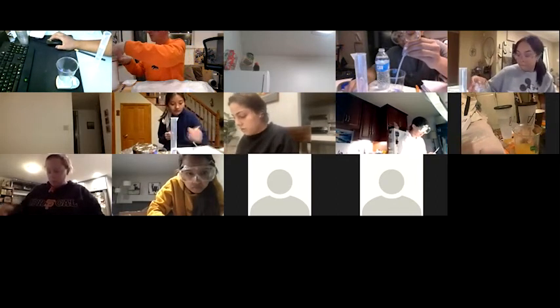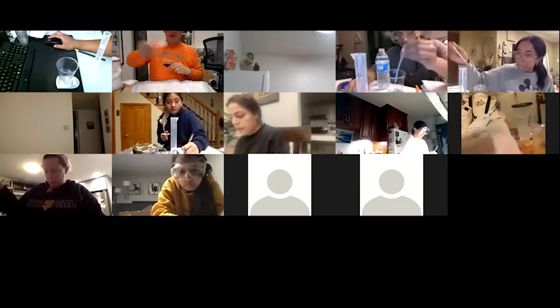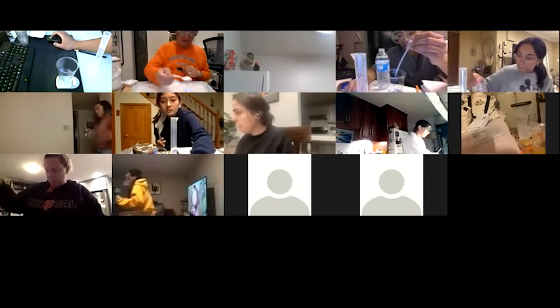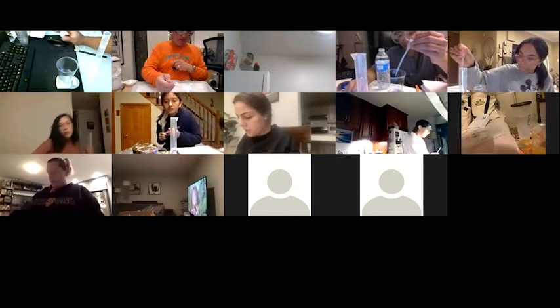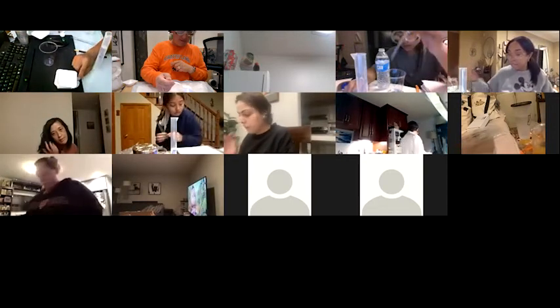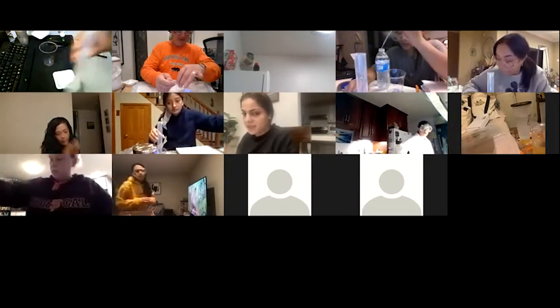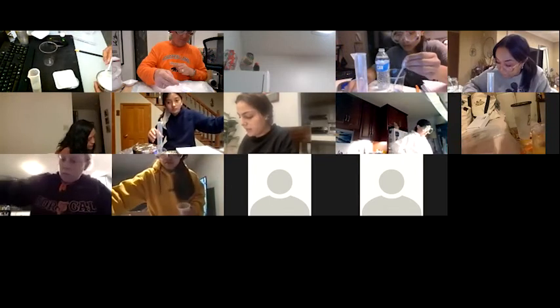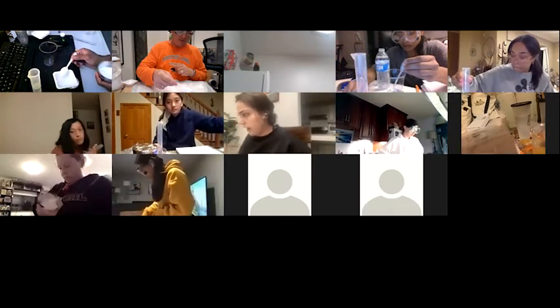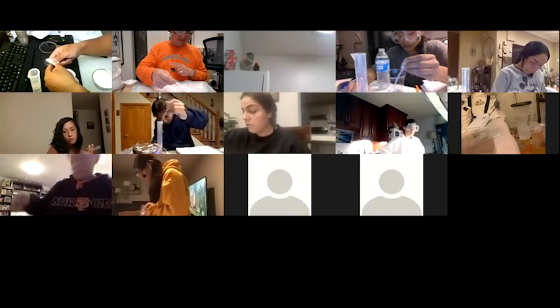So then to add the sugar, and you can see I brought enough for the whole class, you can just use a spoon and add the sugar until you get to 5. So here, it's a good idea to be gentle. Don't just dump it in all at once. Just sort of tap the spoon lightly, because it's really hard to get the sugar out again if you go over. It's best just to tap lightly, a little at a time.